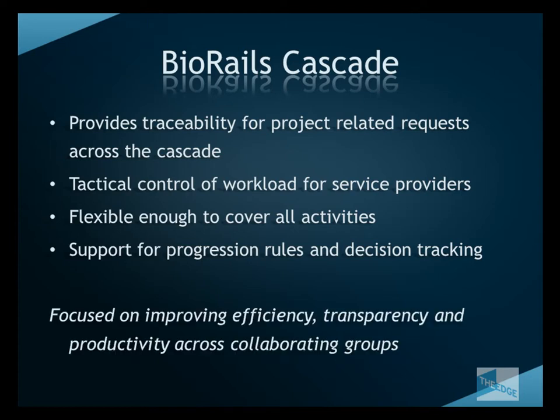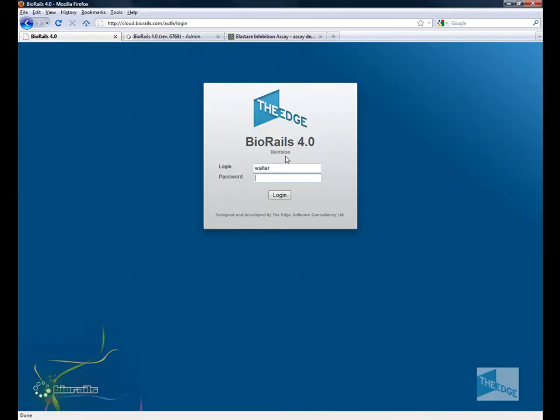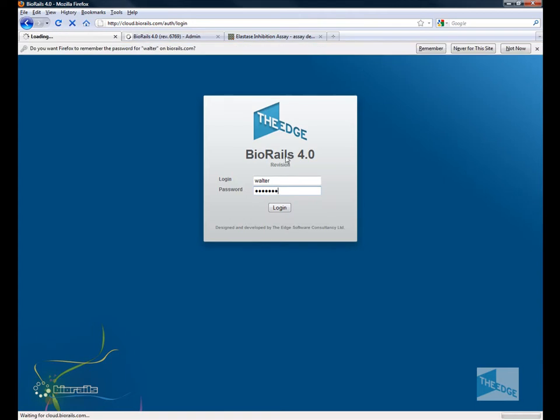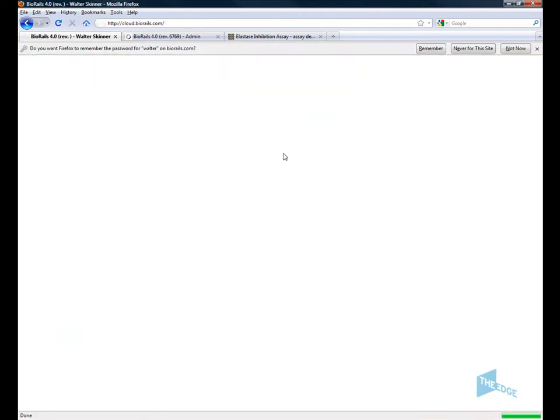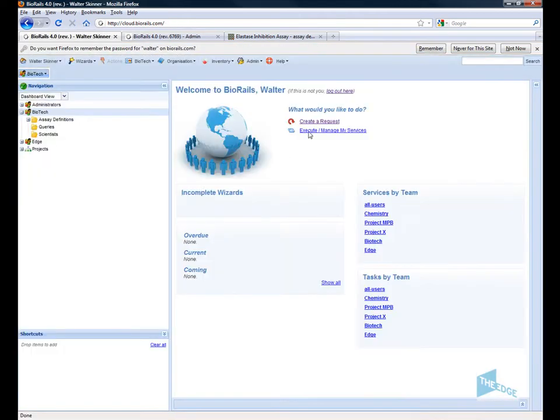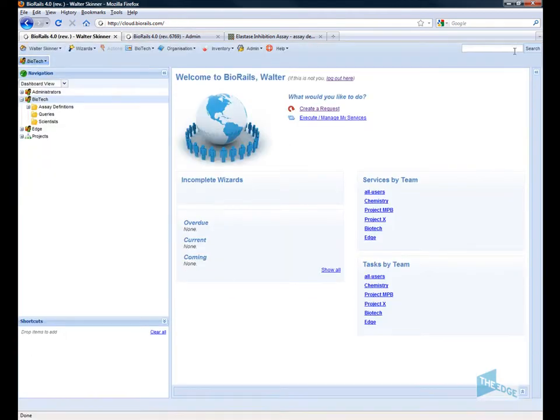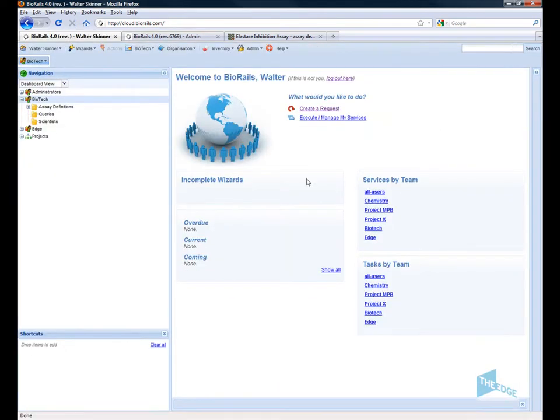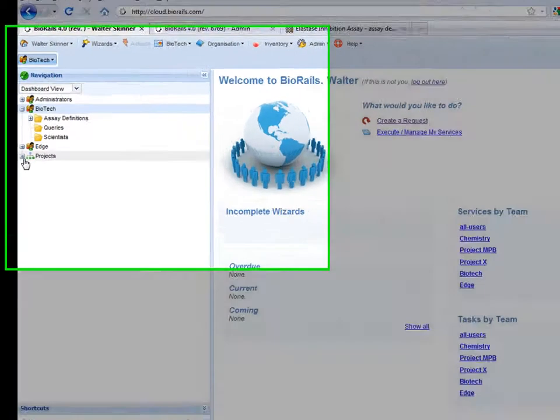Let's start by having a look at BioRails Cascade. First of all I'm going to log onto the server as a project team member.